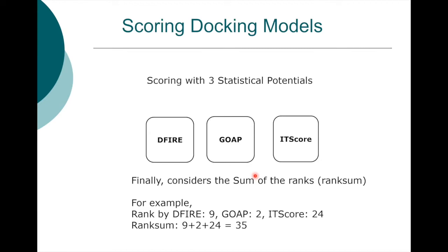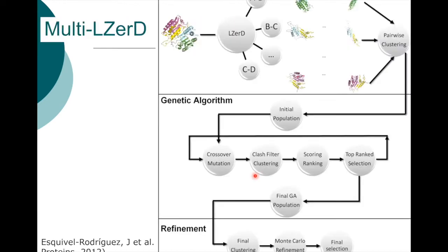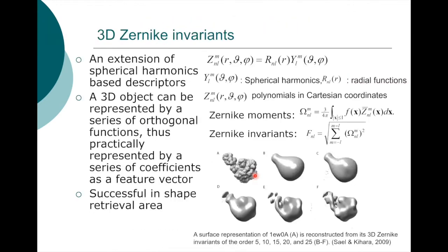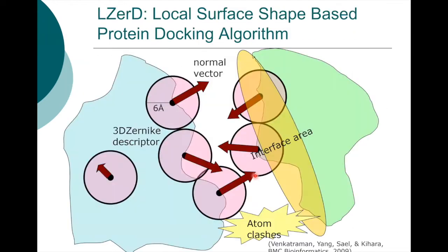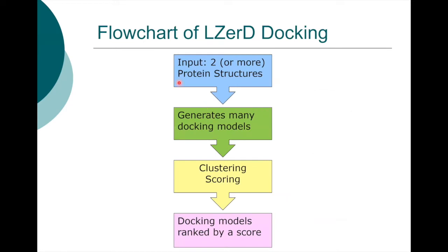So that's it about LIZARD: the input is two structures, generate models, clustering, scoring, and then models are ranked by the rank sum score.